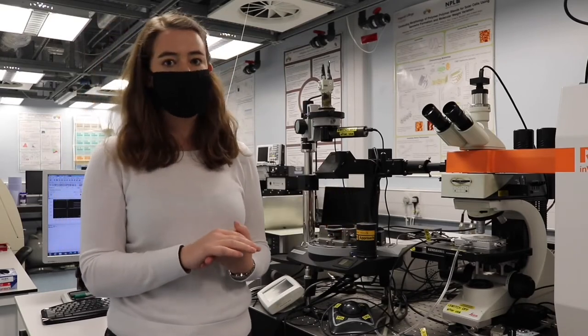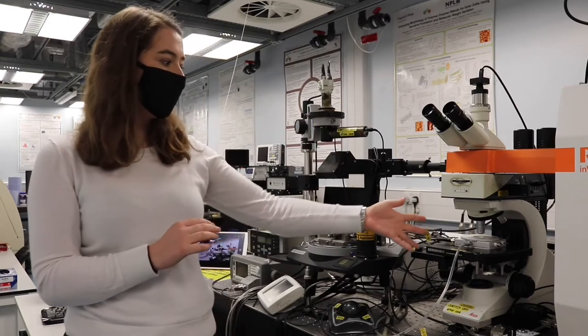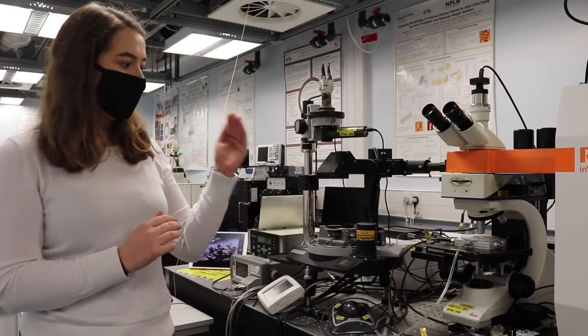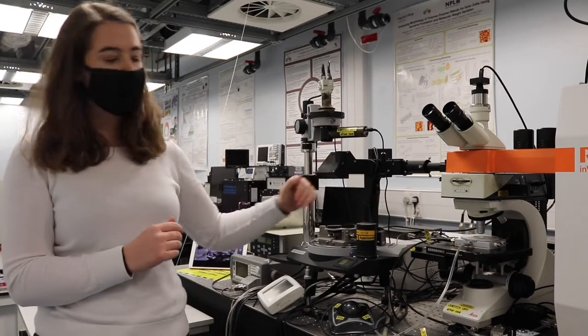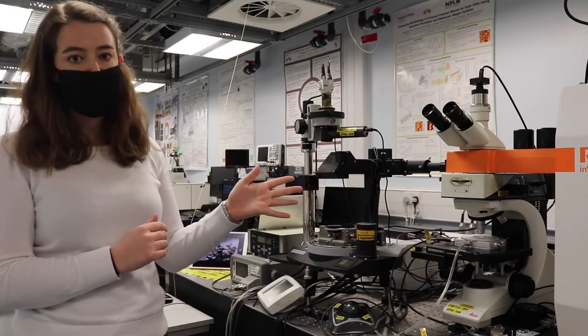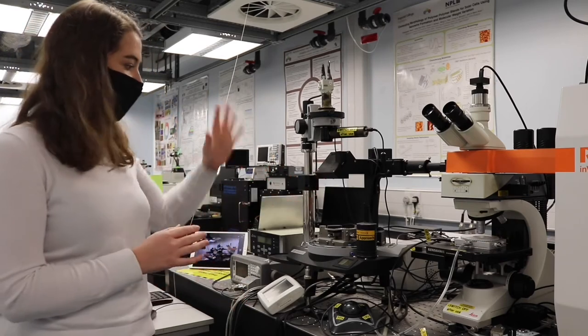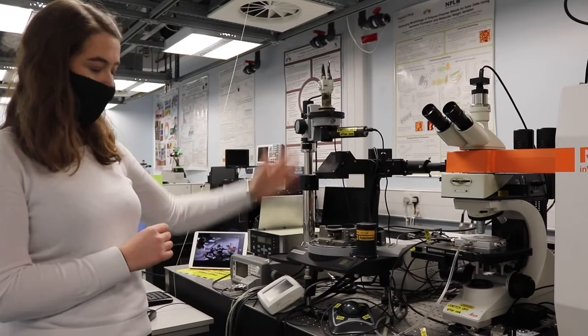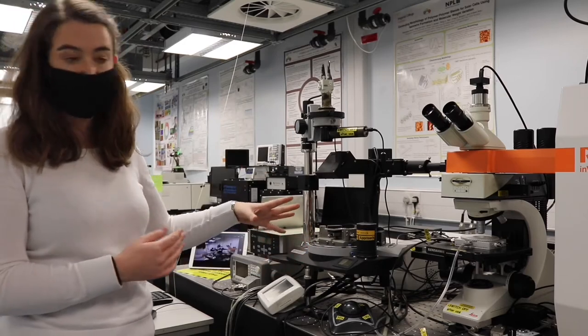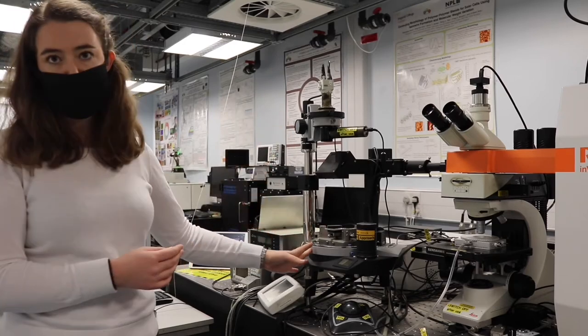One of the things we specialise in our group is doing in-situ measurements. Shown here we can measure the Raman spectroscopy whilst under electrical bias or whilst under gas exposure for our sensing. We can also do Raman spectroscopy at the same time as the AFM using this sample stage here.